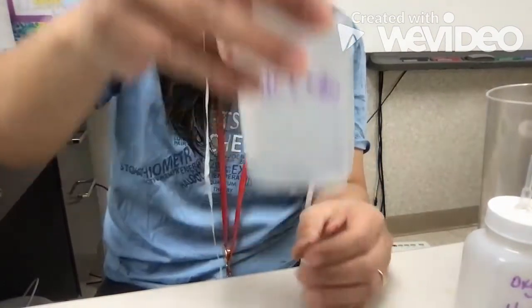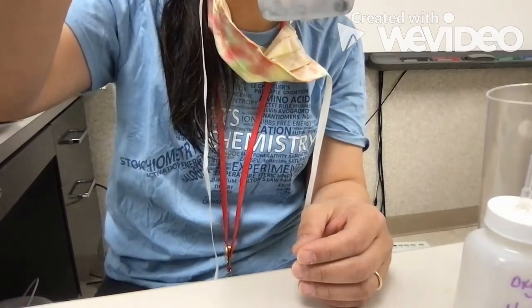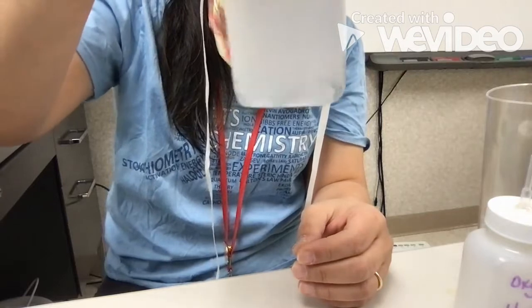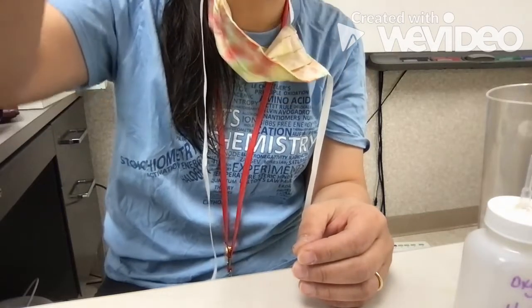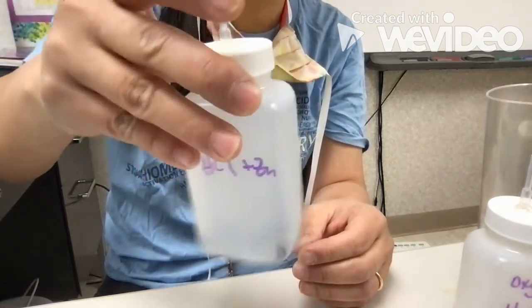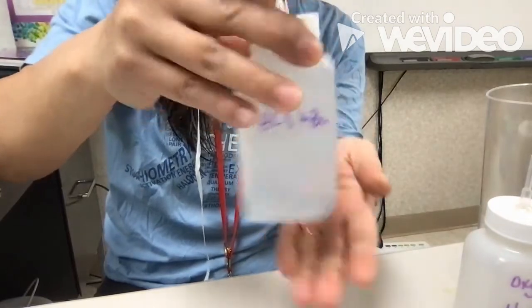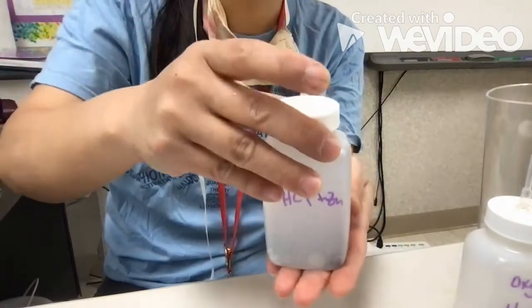Okay, and as you do this, you're going to start seeing bubbles start to form. It'll take a little bit. You might have to shake it a bit. Okay, and wait about a minute or so before you start collecting the gas.